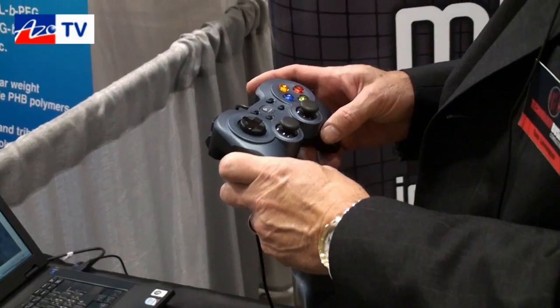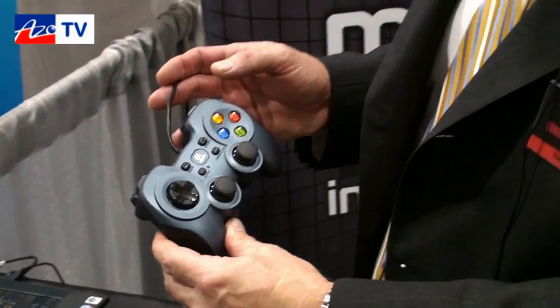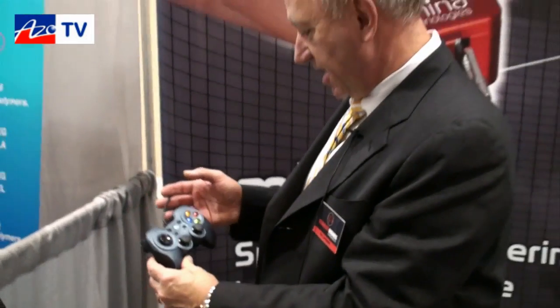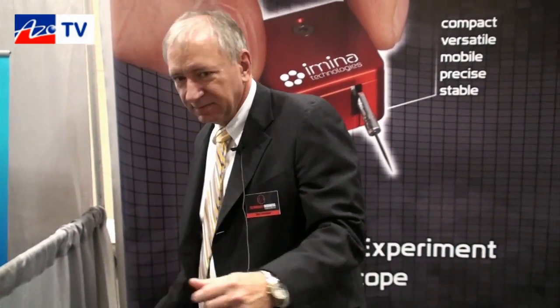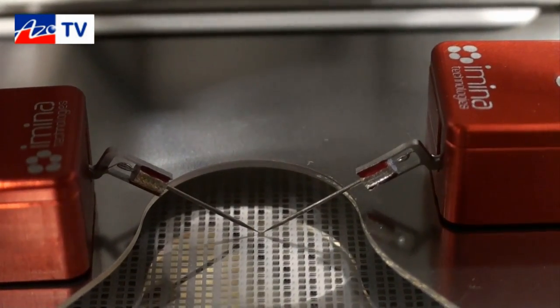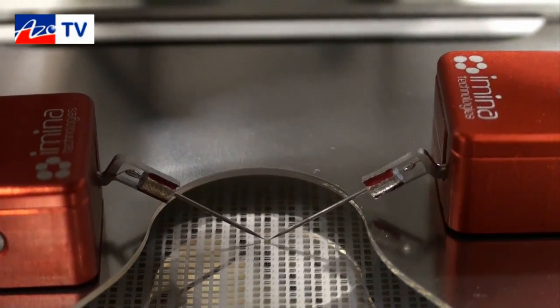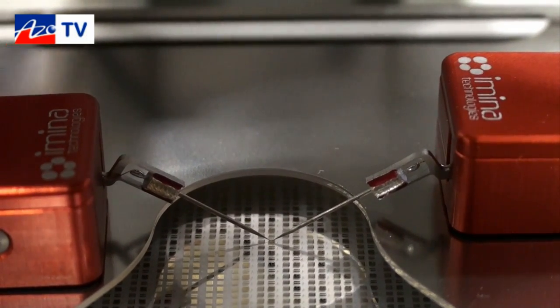The operation of the probe is intuitive. We can simply control which one of our MyBots we are manipulating, and up and down and translation and rotation are all done with a very typical game controller. I think everyone under 40 will be able to operate this product. Maybe we'll get Benoit to give us a little demonstration of how it works. Benoit, please show them how these work.